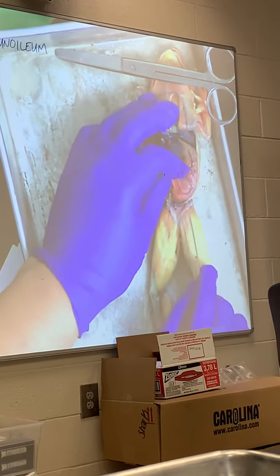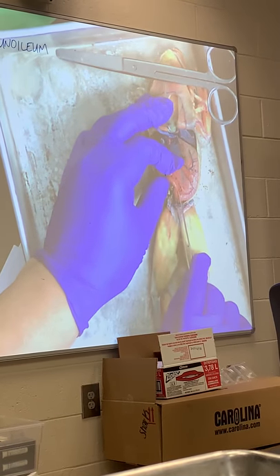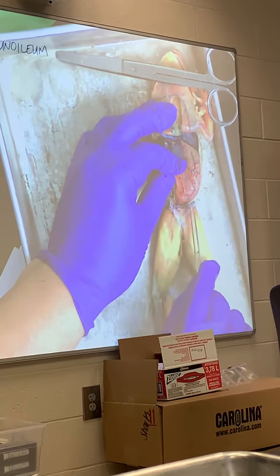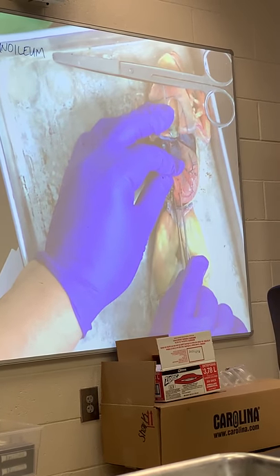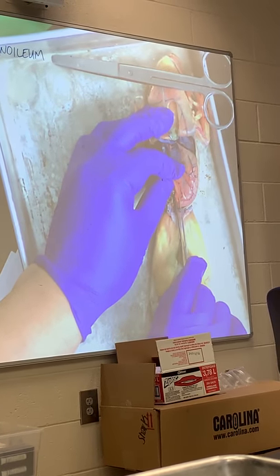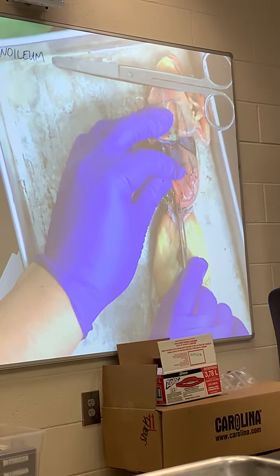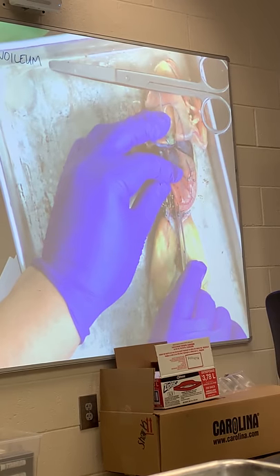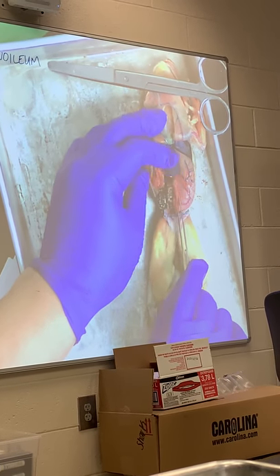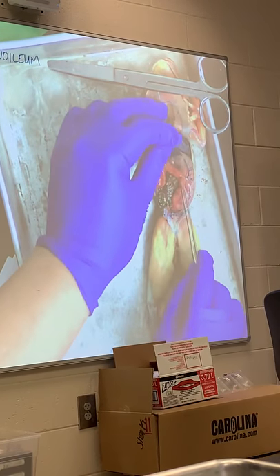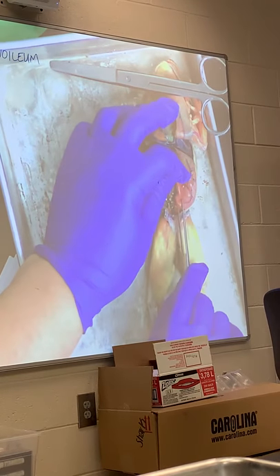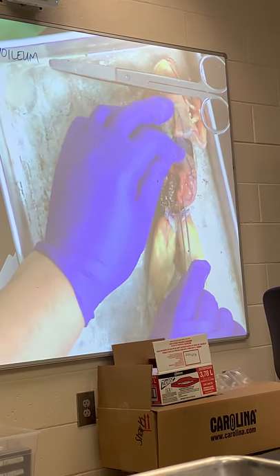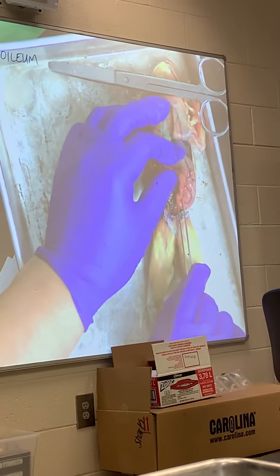And if we look on the lesser curve of the stomach, we can see that as it comes around in this lower part of the J here, you can actually see a pinch or a lessening in the diameter of the tube before the tube continues on. That is where the pyloric sphincter is. P — pinch — pyloric sphincter, pancreas.